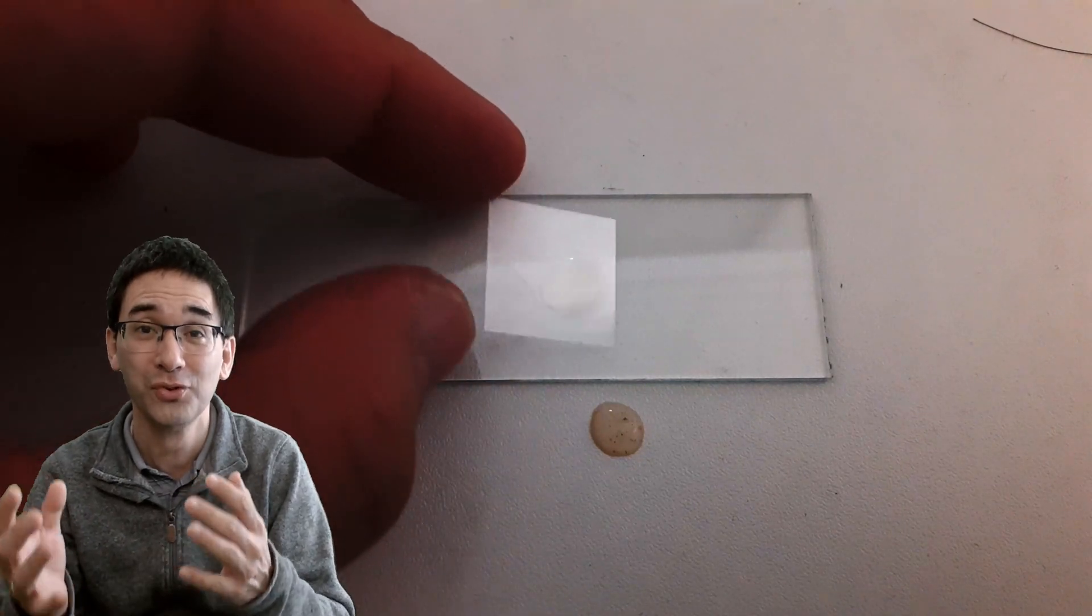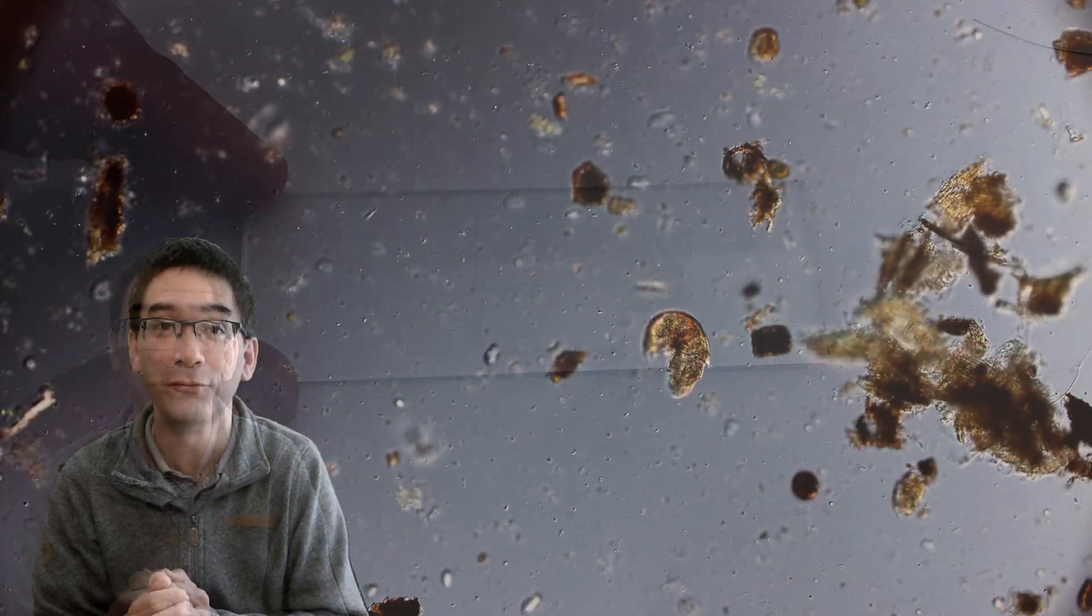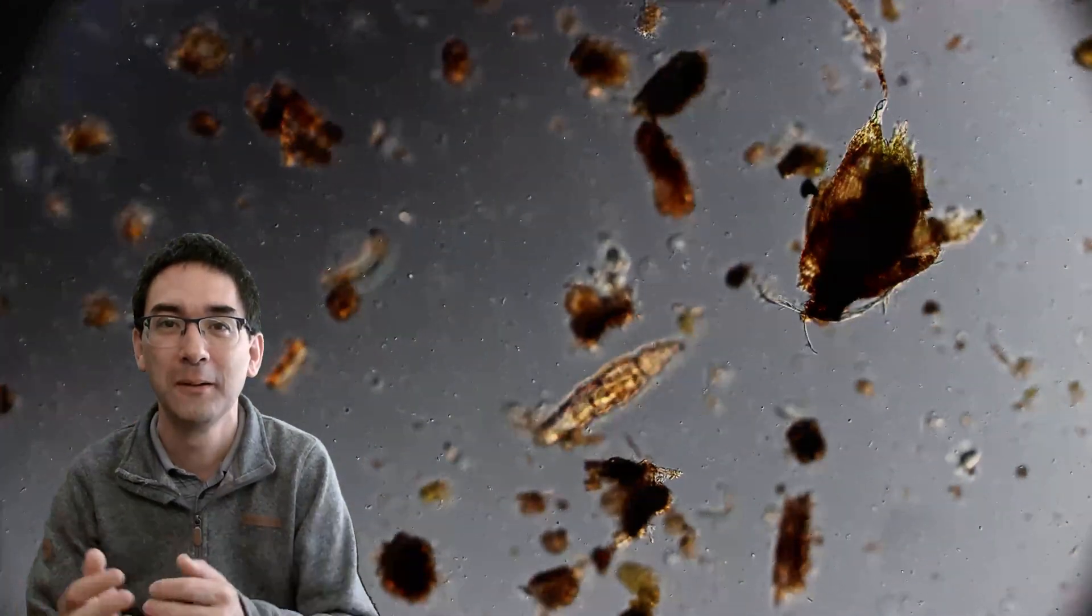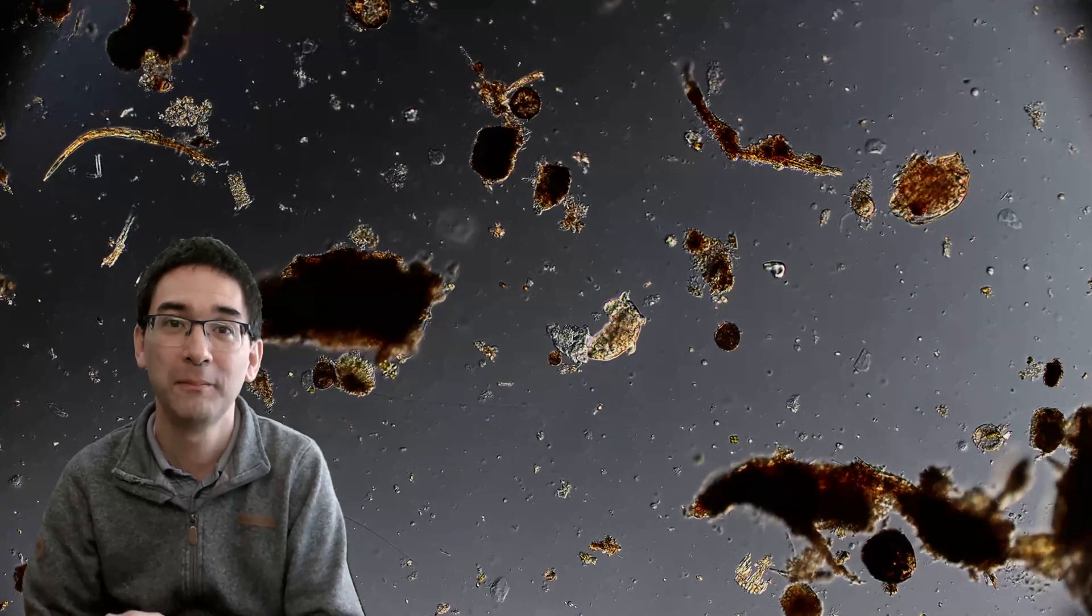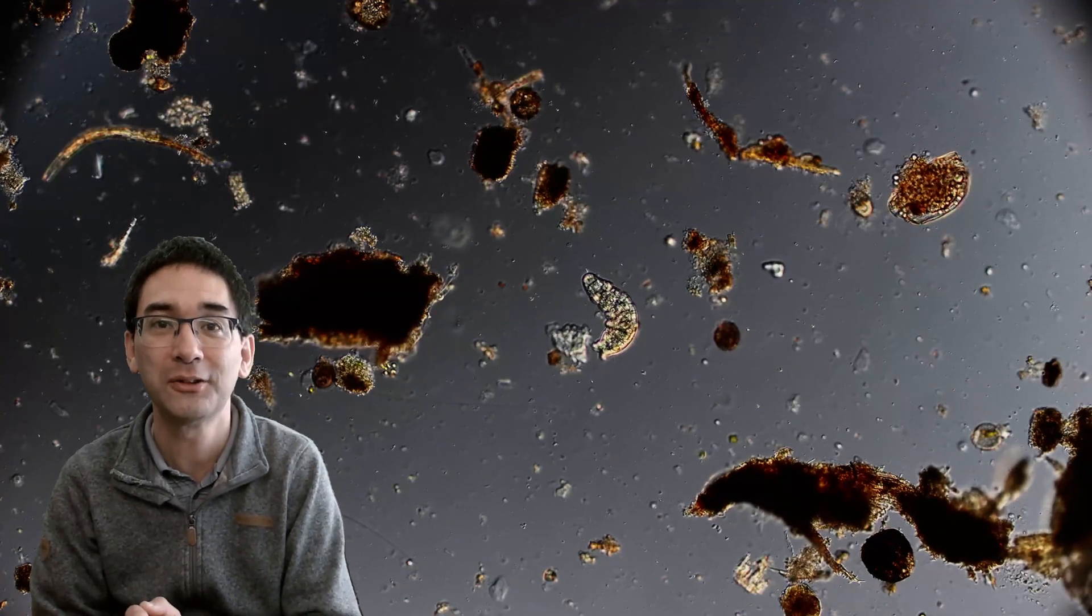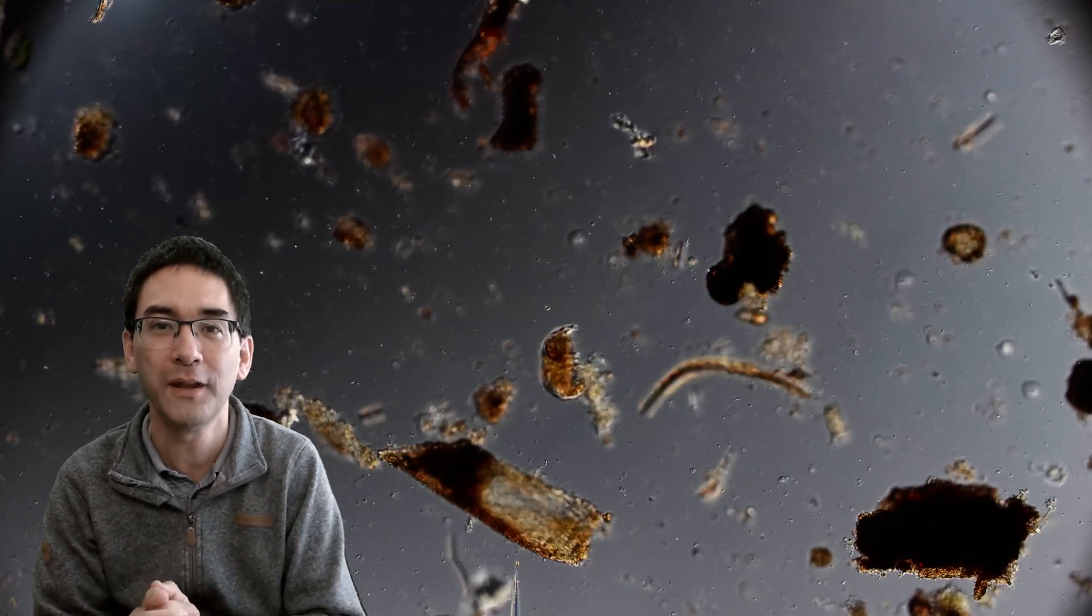Everything went under the microscope. And I was really, really surprised because I found a lot of tardigrades, really. I've never seen in a moss sample so many of them before. So I don't know if it was luck, really. But actually, I was quite successful. This one over here is a rotifer. That's another tardigrade over here in the center. Already in this simple drop of water, I found three or four or five of them. Here is another one.